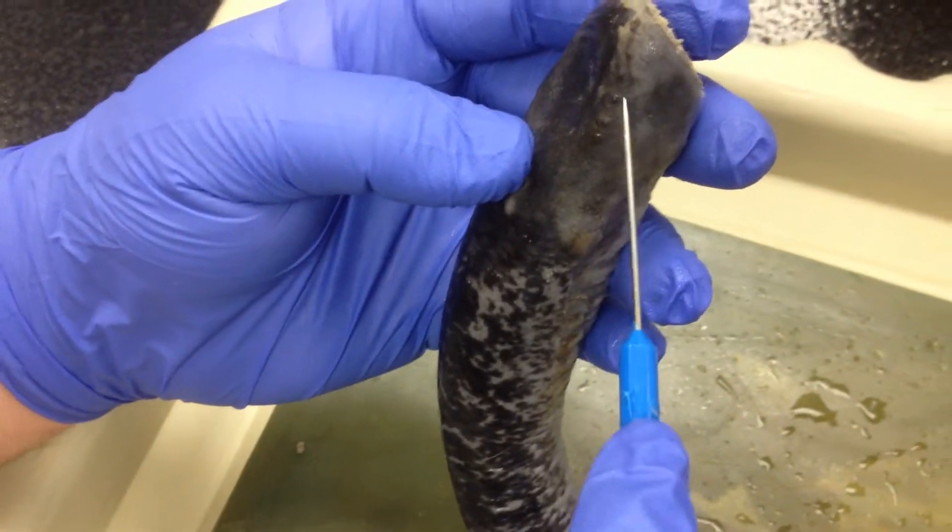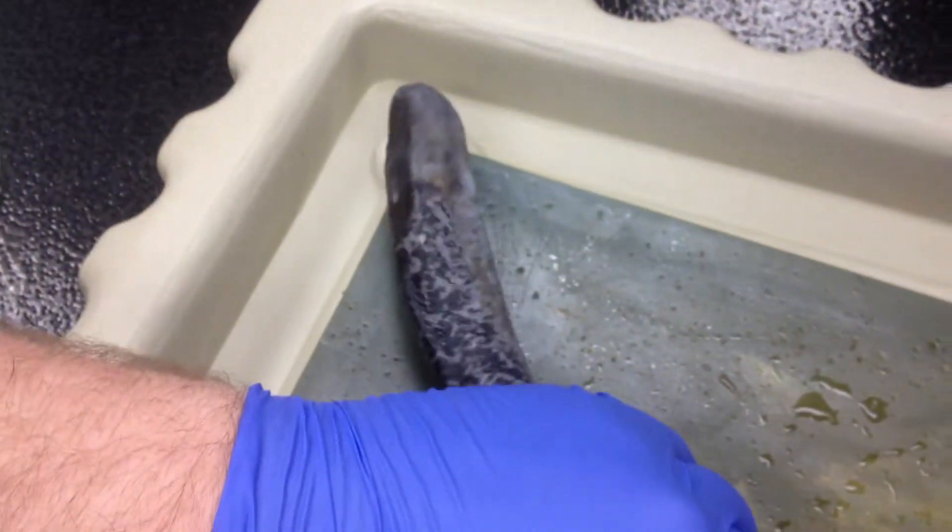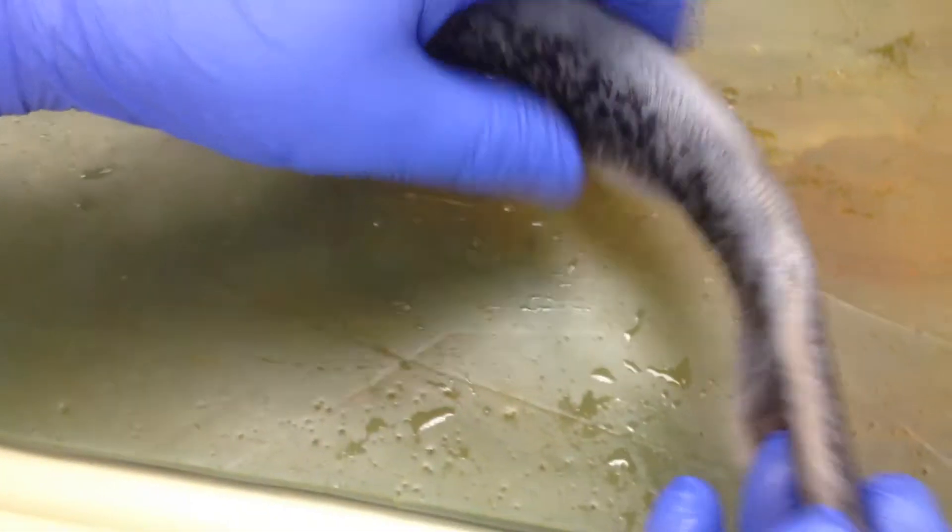Right there, you can kind of see them better on this side — little bumps. On the rear, we have the cloaca.